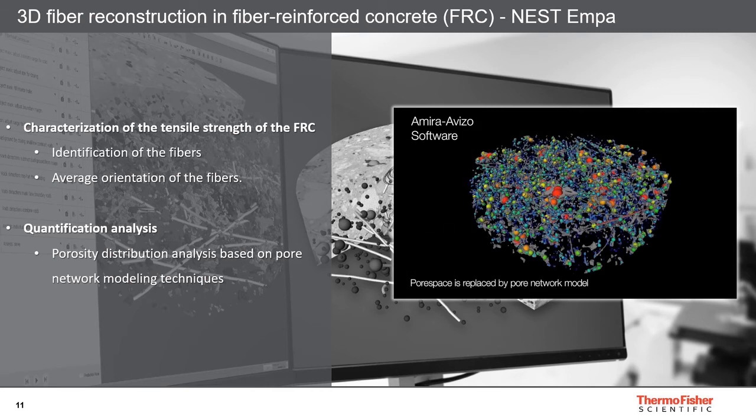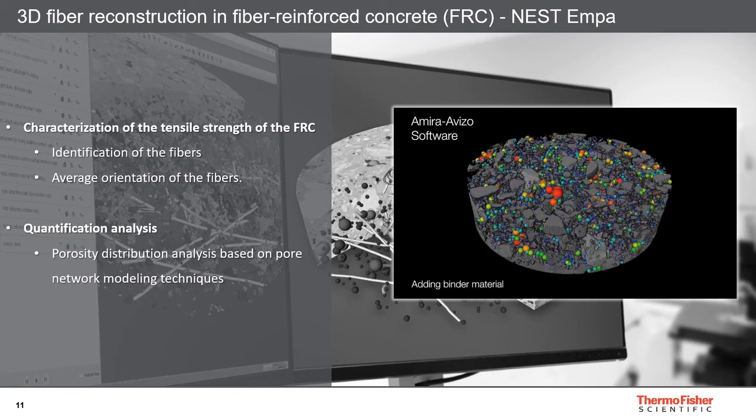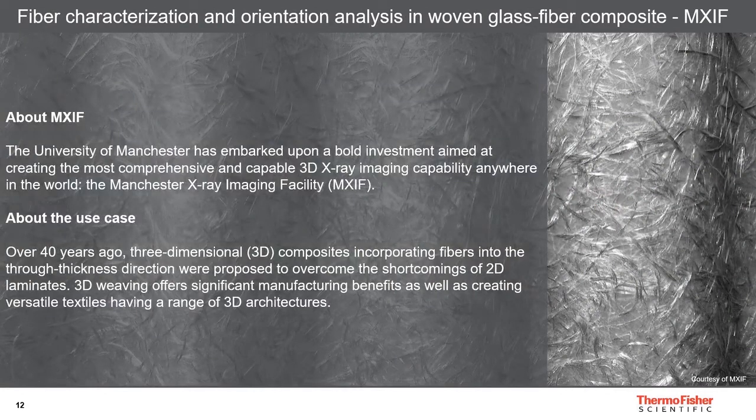Further quantification is performed to analyze porosity distribution in the concrete based on pore network modeling technique. The University of Manchester selected Avizo Software as a solution to visualize and analyze all the image-based data they generate.